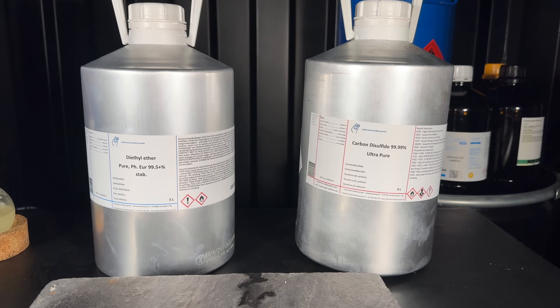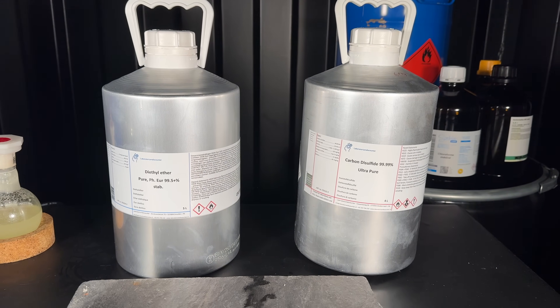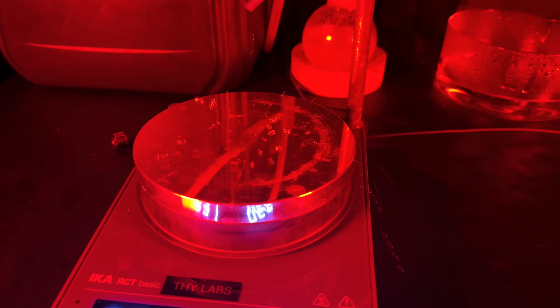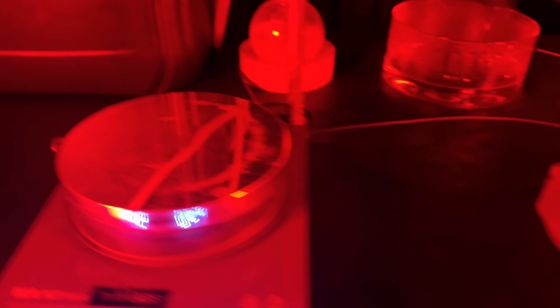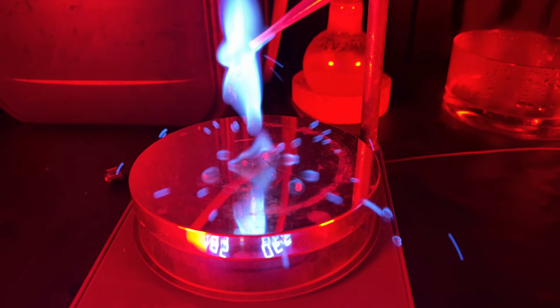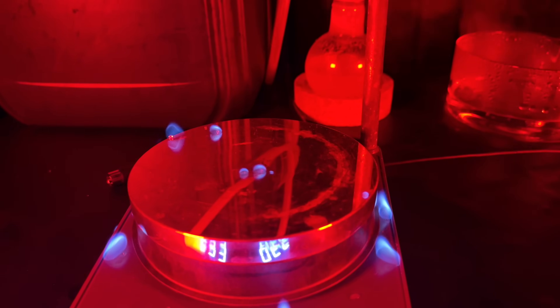Carbon disulfide has an insanely low auto-ignition temperature — it apparently ignites at 90 degrees Celsius, and I'm going to test it. I first tried ether; ether is also known for apparently self-igniting, but not as much as carbon disulfide. And there you go — it ignited, making this beautiful blue flame.